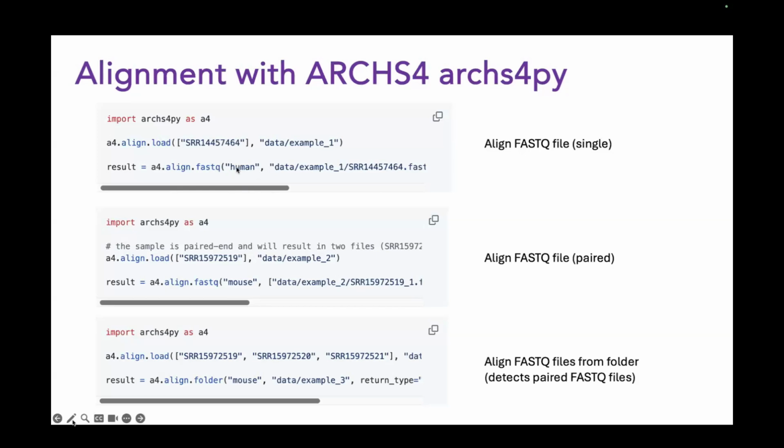You can immediately see that a couple of steps you usually have to deal with are missing. This package automatically downloads all the required reference genomes, builds the index if it doesn't already exist, and then does the alignment automatically. So instead of dealing with all of this, it's just a single line of code to do the alignment.